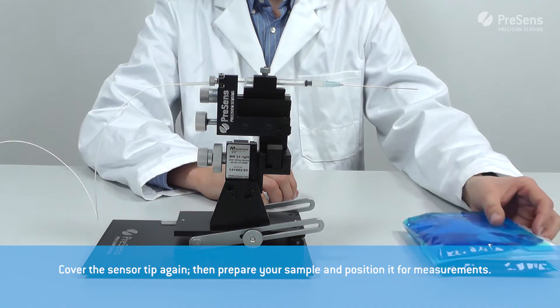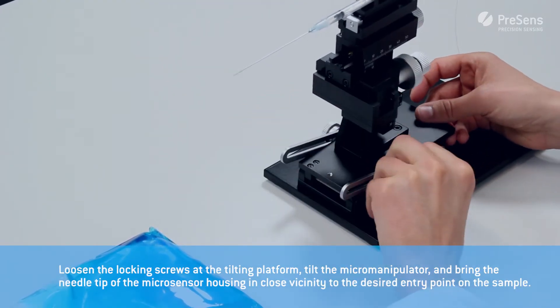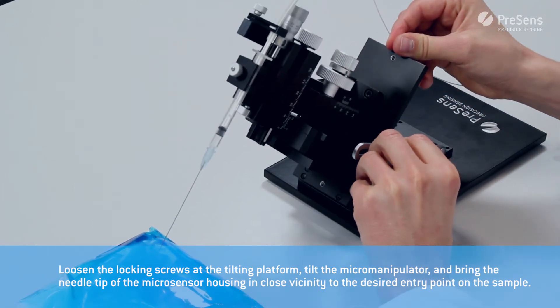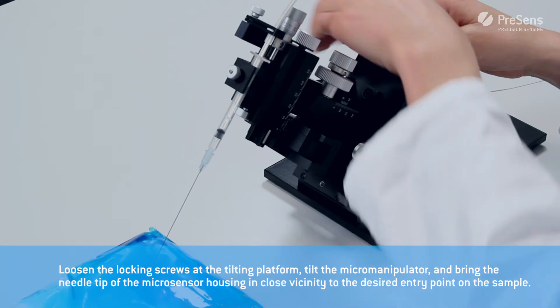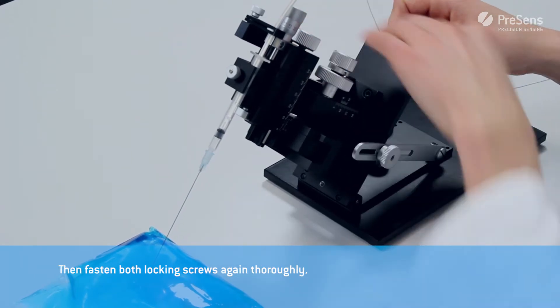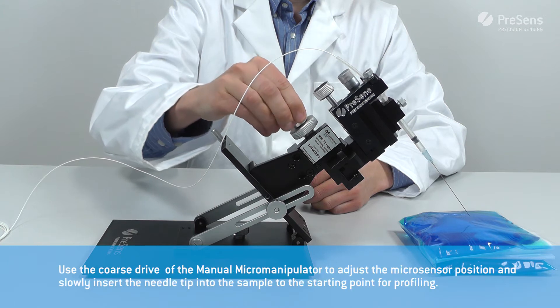Prepare your sample and position it for measurements. Loosen the locking screws at the tilting platform, tilt the micromanipulator and bring the needle tip of the micro sensor housing in close vicinity to the desired entry point on the sample. Then fasten both locking screws again thoroughly.